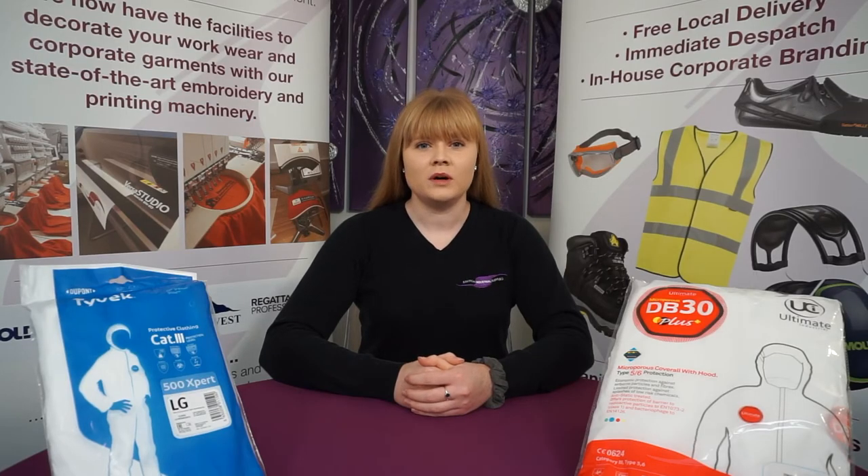Hello and welcome to our short video on disposable coveralls. These type 5b and 6b coveralls provide protection against harmful chemicals and agents, and the anti-static properties ensure electrostatic protection.